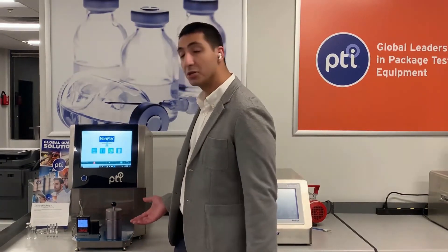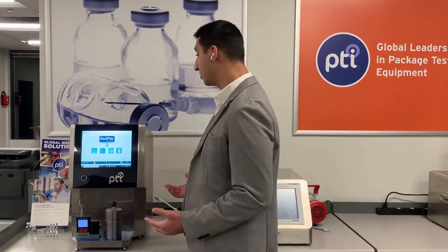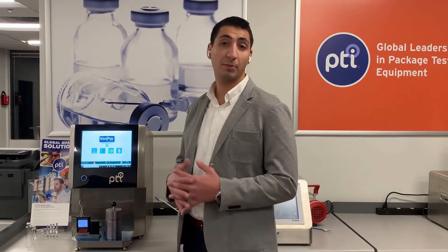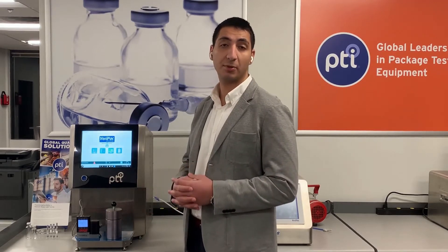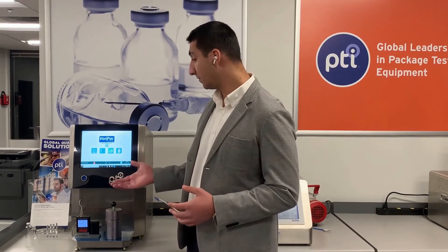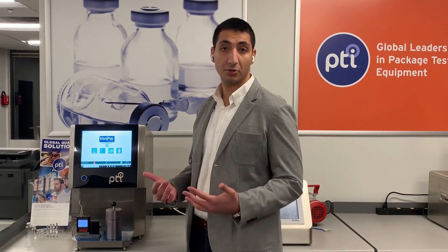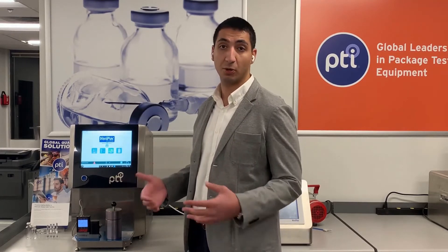PTI's test chambers are custom-built for your specific needs. Applications for this system would be just about any parenteral package or rigid package application your industry has to offer, whether they're glass or plastic, such as liquid and lyophilized vials, empty or pre-filled syringes, ampoules, API containers, and much more.